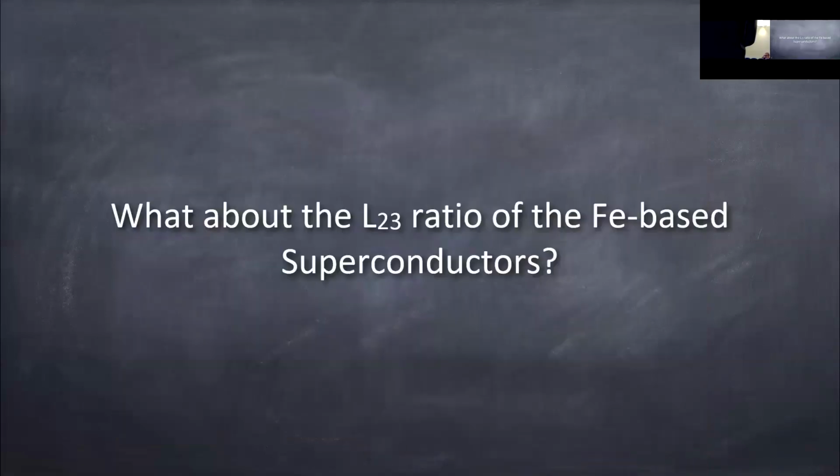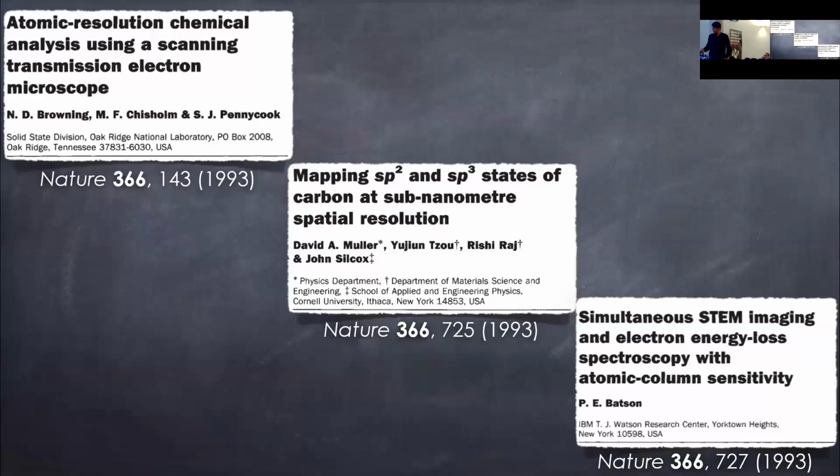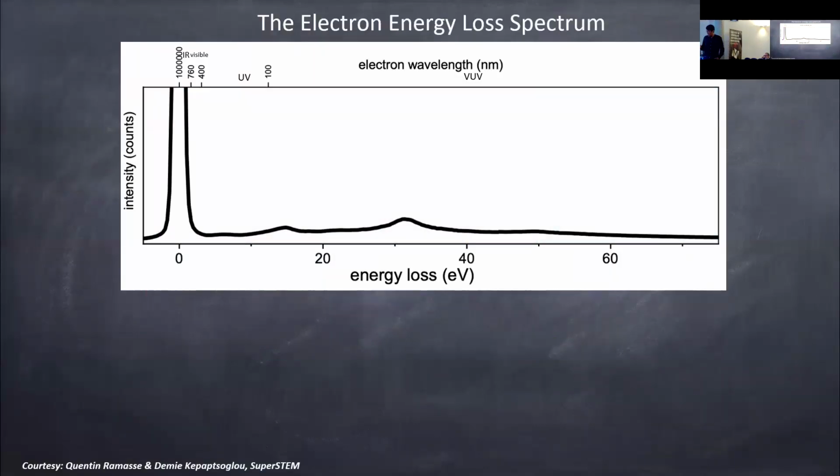And then what I did is measure the ratio between this peak and that peak. There are various ways to do this. One is to just take the spectra and measure this ratio directly, the intensities, or take the second derivative of the spectra. That was done by Gianluigi Botton in the early 1990s. When you take the second derivative of the spectra, you can think that this one is a Gaussian, that one is a Gaussian, and then the spectra comes from, let me go back. Where is it? Yeah, here.